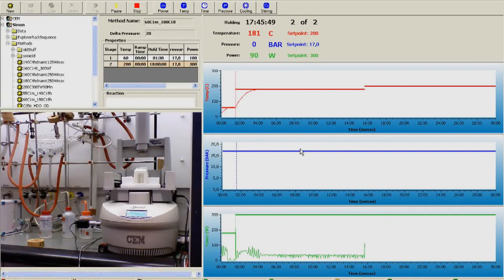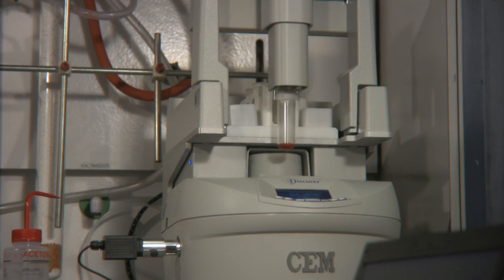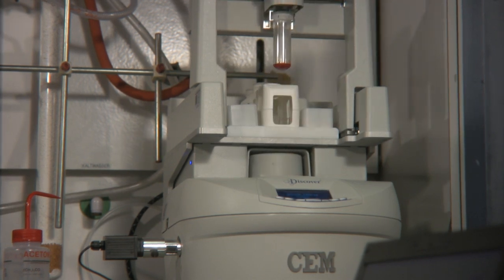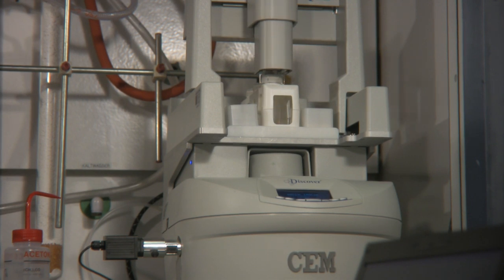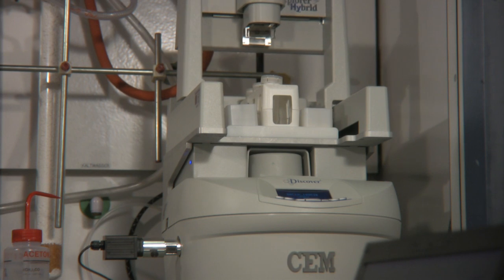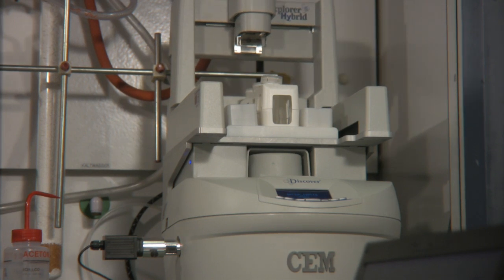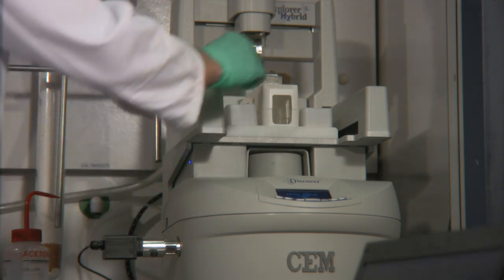The set point change is performed from outside the laboratory. With BWE Labs it is possible to exactly reproduce experiments based on standardised conditions and parameters on site and externally via remote control.